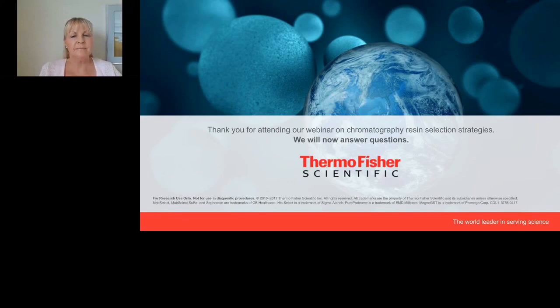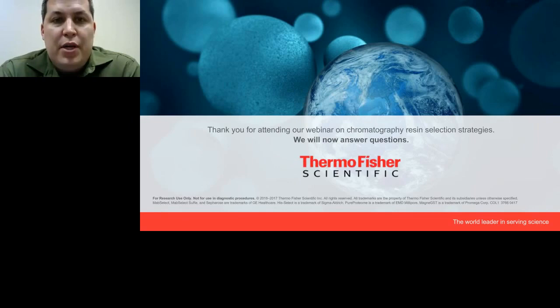So due to the bead structure, again, for the poros, it's rigid and incompressible, so you can use high pressure columns. However, you can use this typical stainless steel or glass column, and that would be perfectly sufficient. Part of the structure of poros itself allows it to generate low back pressure, so even though it's a smaller particle bead, you don't necessarily get a huge increase in back pressure as you typically would see in smaller beads.